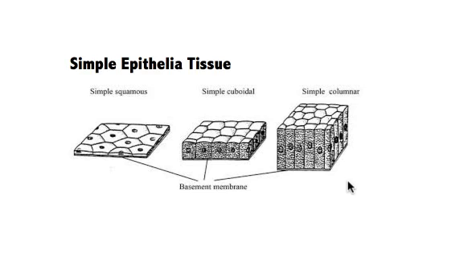These types of cells can be found in the trachea, which is the windpipe, the bronchi, which is just below the windpipe and has kind of like the branches that come off the windpipe, and the small intestines. And this is the cell here.